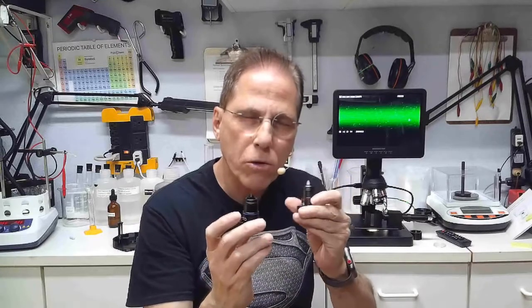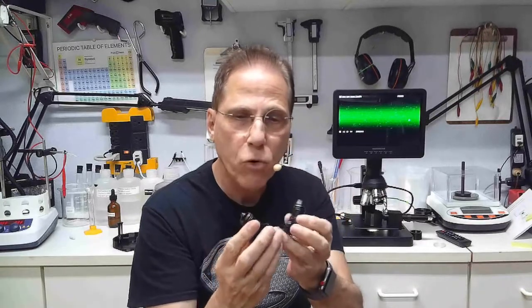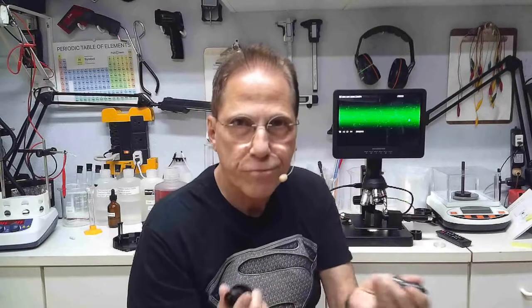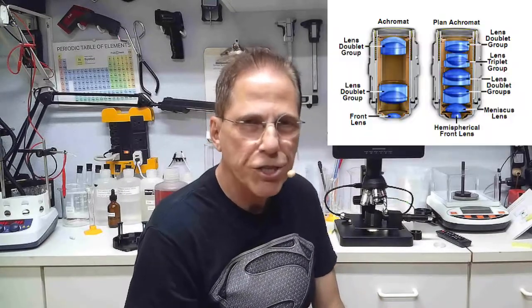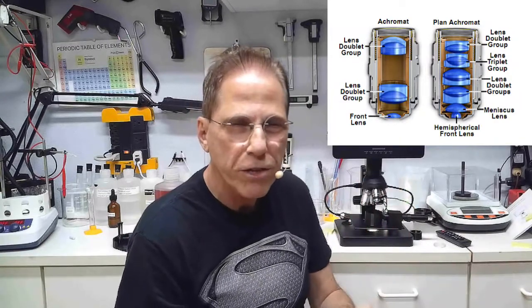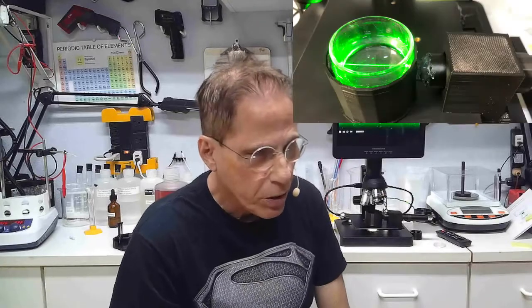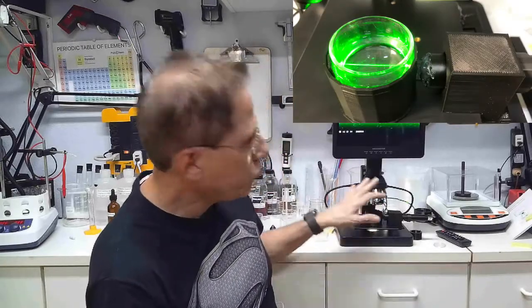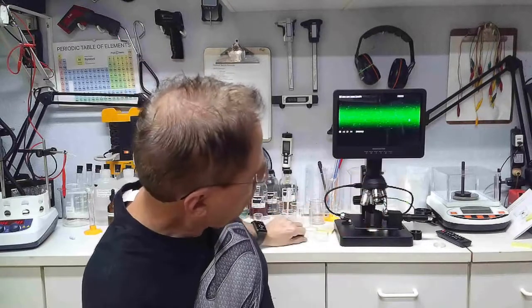The stock lenses are not achromatic — they don't correct for refraction or color aberration. The new lenses I got do correct for reflection and aberration, giving a much sharper image with less reflected surfaces, which is important because we're shooting pictures of colloidals using a laser beam. There is a substantial improvement using the achromatic lenses over the stock lenses that came with the microscope.